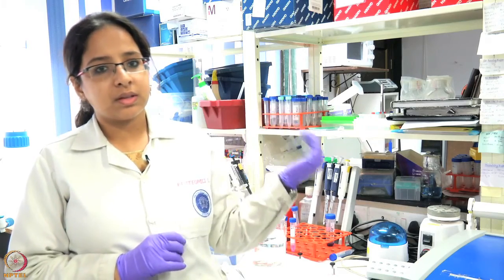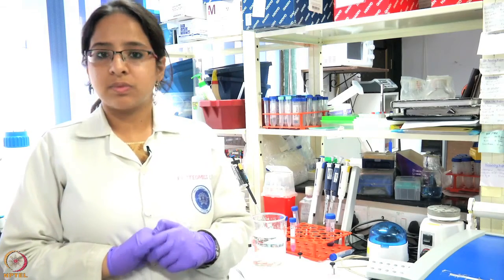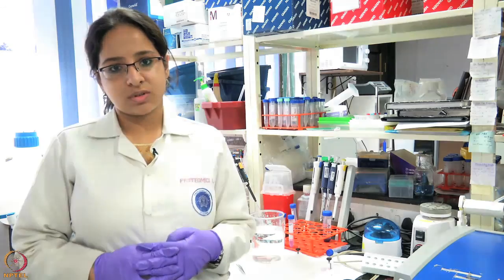So, this is how the 2D DIGE principle works, and it's a very important gel based proteomics approach and has definitely more advantages than the regular 2D approach. But 2D approach, again, a lot of people use it for other purposes. So, both the techniques, they have their own merits and demerits, but they are very important gel based proteomic approaches.